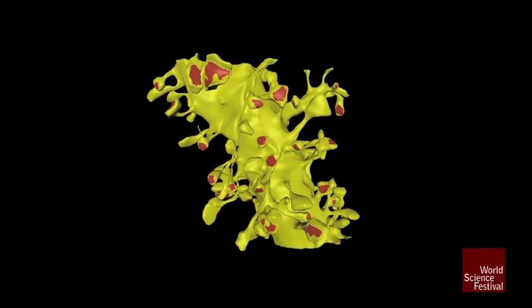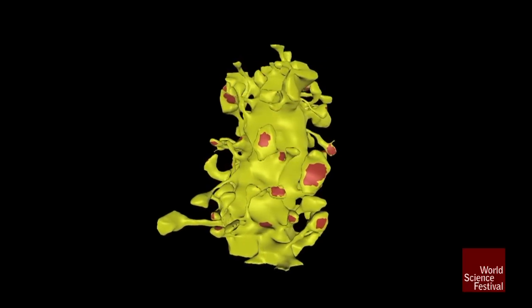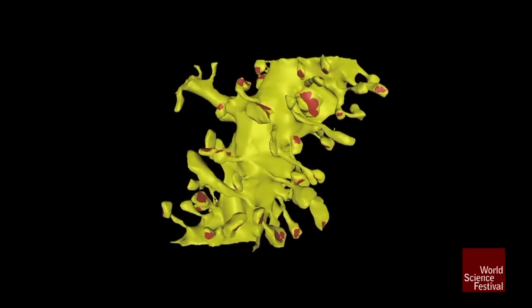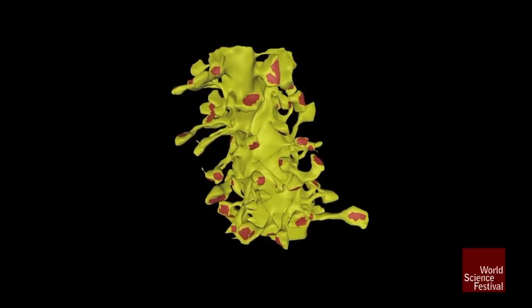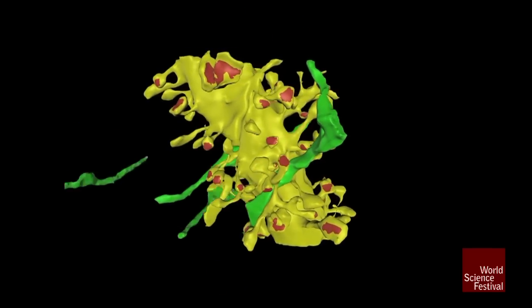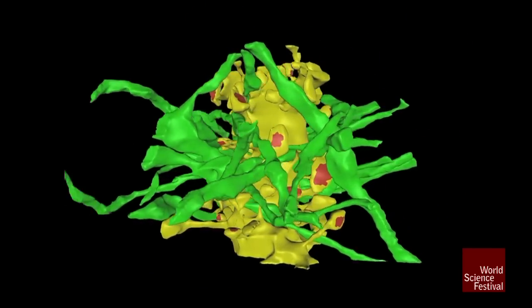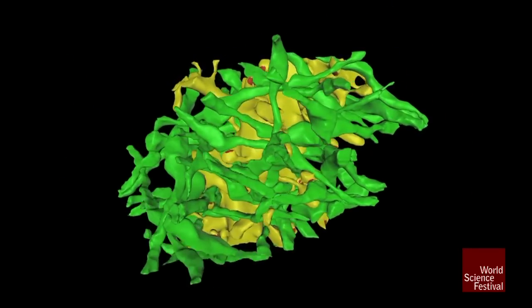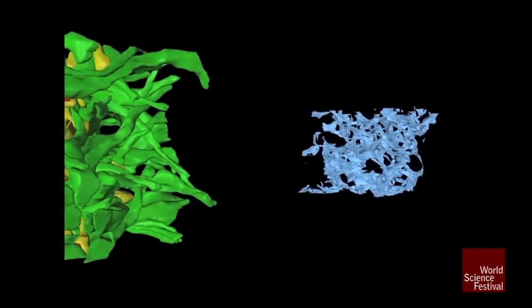So we chose this volume to be sufficient to surround this dendrite at the reach of its longest spine. So the first question one can ask is, gee, you have this dendrite, it has all these little spines sticking out, how many synapses can it make? And of those axons that come within reach of those spines, what fraction of them actually make a synapse? So now coming in to dance with this dendrite are all the axons in that little tiny volume of neuropil, and you're going to find out how small it is in a moment, that actually make a synapse on that central dendrite. And two of us, Joe Spacek and I, actually manually traced every one of those through 200 serial sections to identify where the synapses occurred.